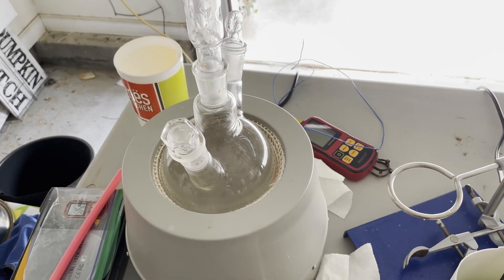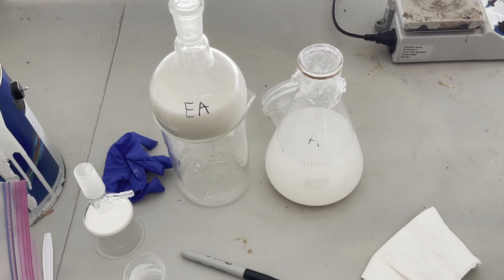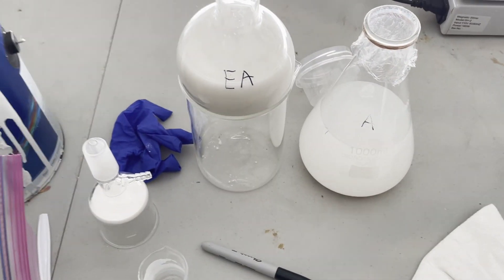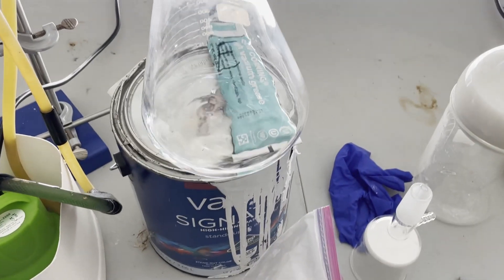So while the ethanol was distilling, I decided to start drying the ethyl acetate and acetone. All I did for the acetone was add anhydrous sodium carbonate, and I did the same calcium oxide method for the ethyl acetate.